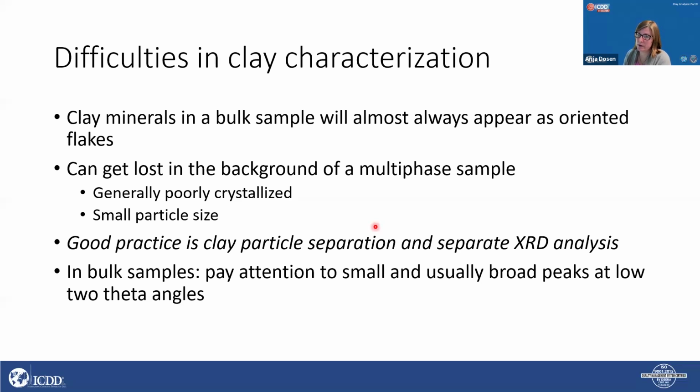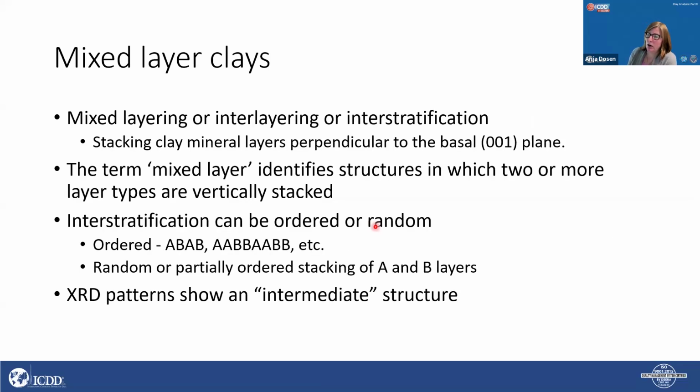What is a good practice is that we prepare clay samples separately. So we can do particle size separation, which I talked about last time, and do a separate XRD analysis of clay samples. But if we're looking at a bulk sample, we want to pay attention to broad and small, low intensity peaks at low 2 theta angles.